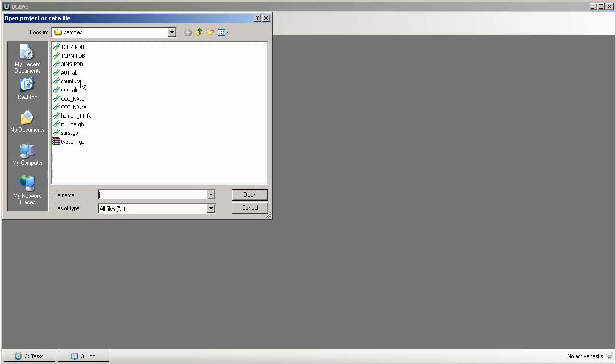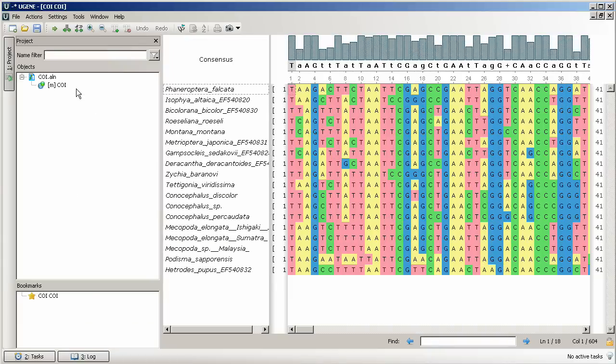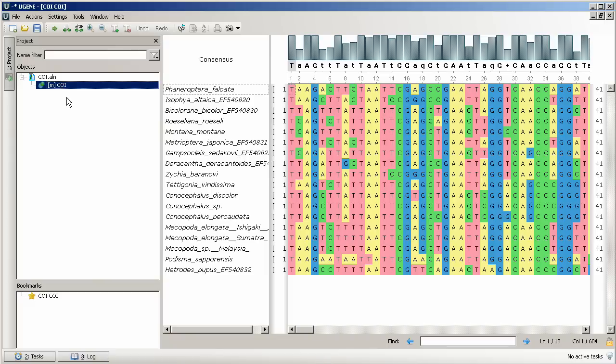Let's open a file with multiple sequence alignment. As always, the file and its contents list have appeared in objects area of current project view.